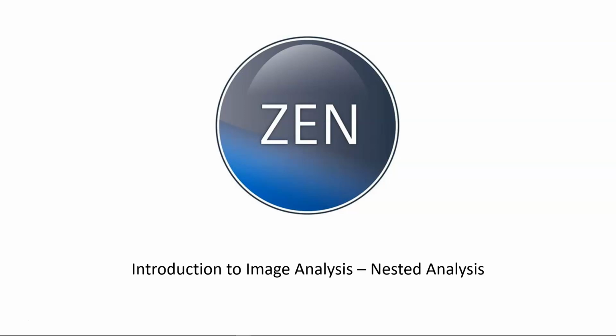Zen imaging software from Carl Zeiss provides a number of methods of quantifying image data. This tutorial is intended as a follow-up to the previous introductory walkthrough of the image analysis module and assumes the viewer is familiar with basic concepts of thresholding or segmentation, filtering, and reporting of data. Here we will extend those concepts by involving two fluorescent channels in a nested analysis, identifying individual cell nuclei and classifying them in groups based on the presence of mitochondria.